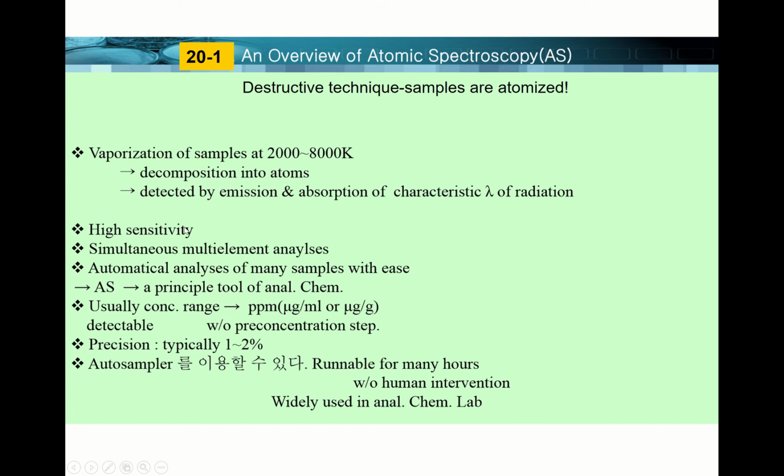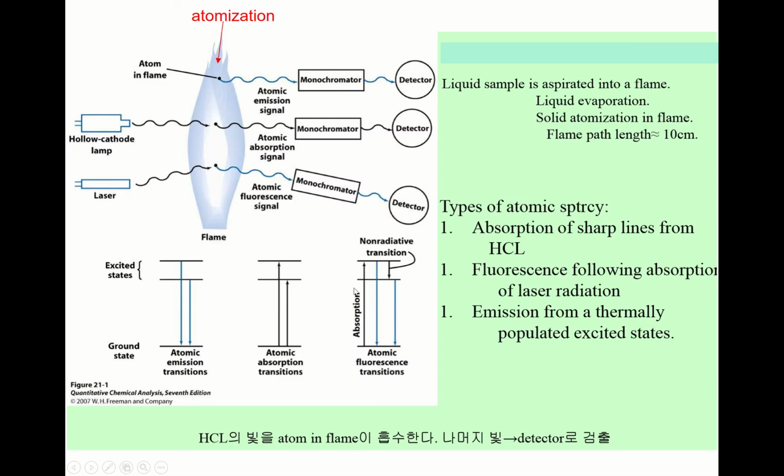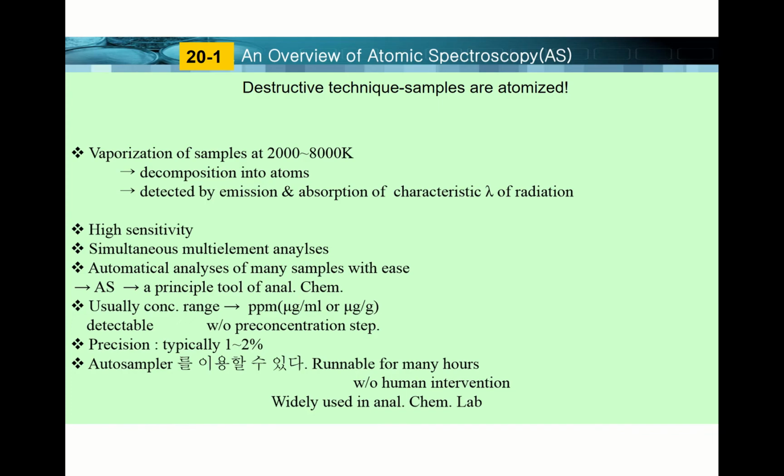And what are the characteristics of this technique? They are highly sensitive, very highly sensitive. Part per trillion concentration can be detected.